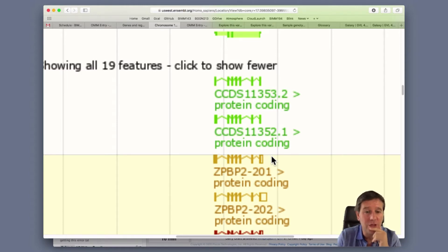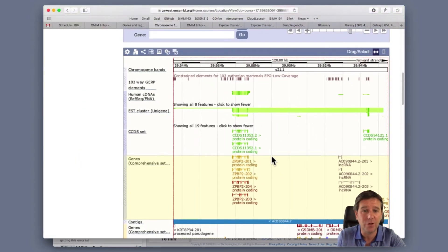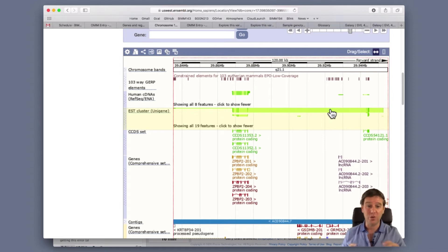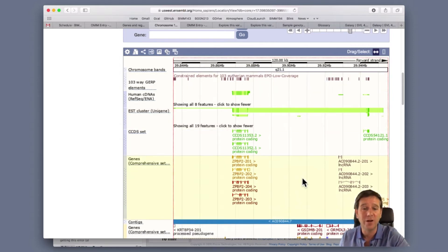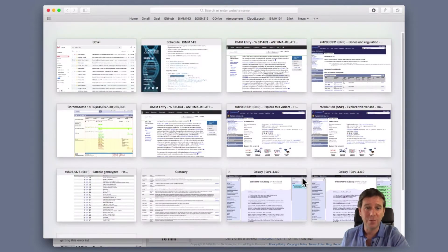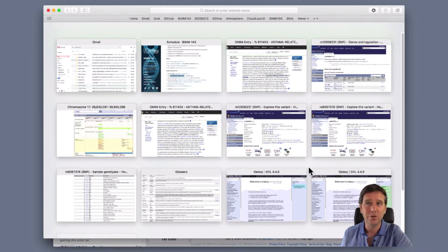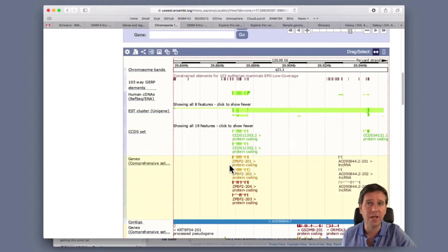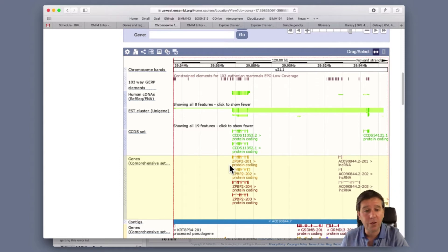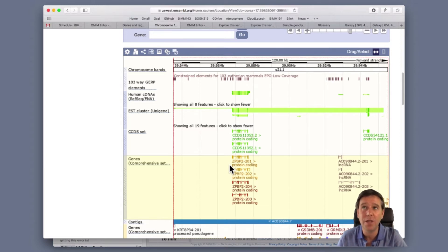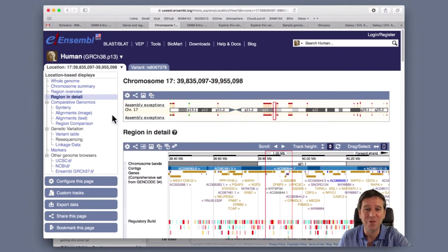Like UCSC that we're going to see later on as well, there's a lot of stuff displayed. Here's another GSDMB and I could click. It's very easy when you're not used to using these tools to get lost and have a bad zoom setting. It's just one of those things where we have to be patient - these online genome browsers are a little fiddly and tricky to use. But with practice and time and patience, you can extract some pretty useful information out of these browsers.